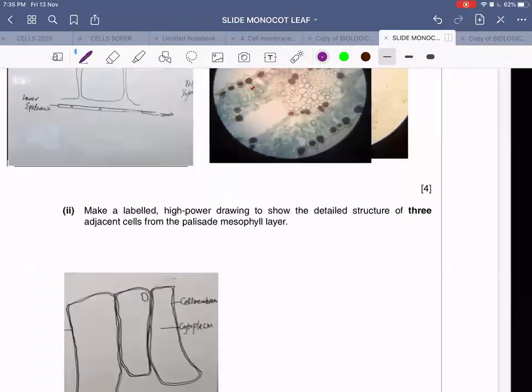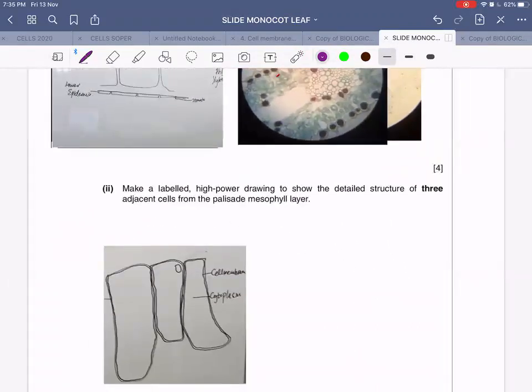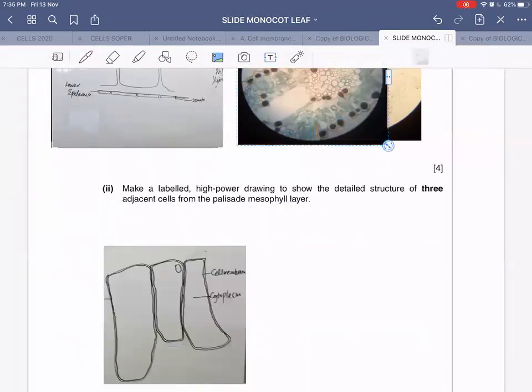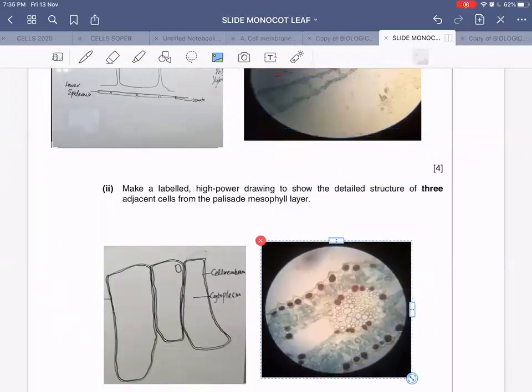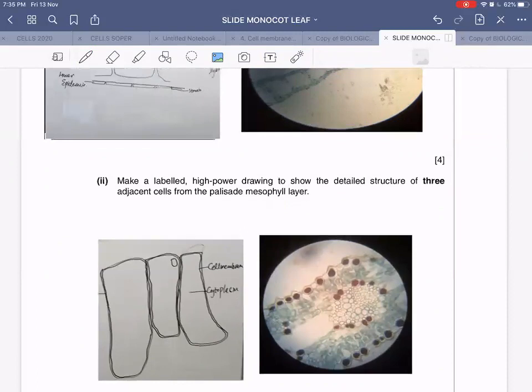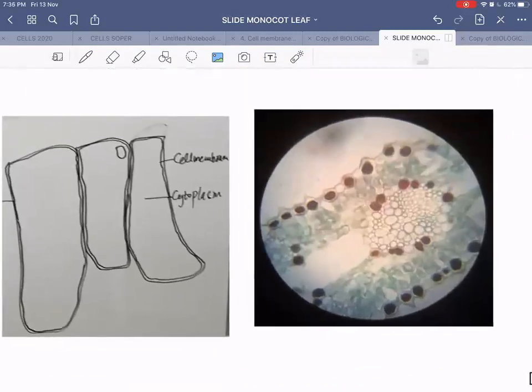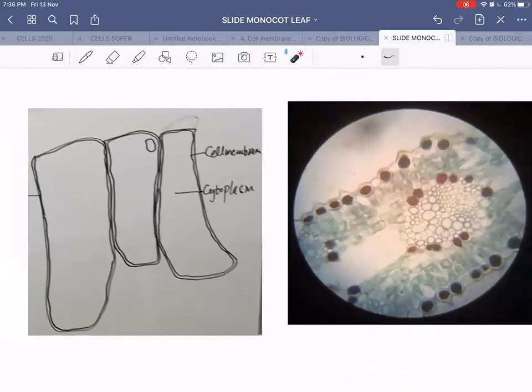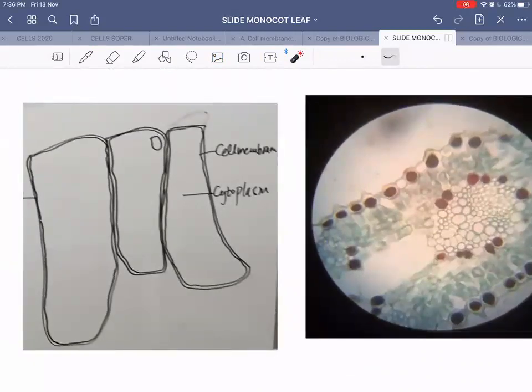Moving on to the second part: make a labeled high power drawing to show the detailed structure of three adjacent cells from the palisade mesophyll layer. To draw the palisade mesophyll cells, turn your lens to a power of 40, giving a total magnification of 400. Randomly choose any three adjacent palisade mesophyll cells, zoom into them, and draw a diagram.